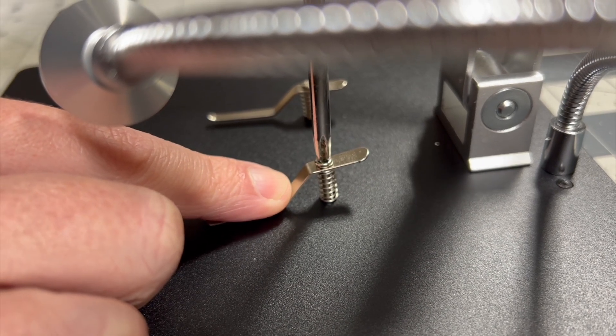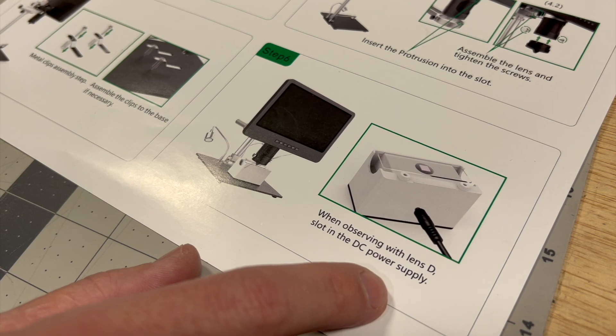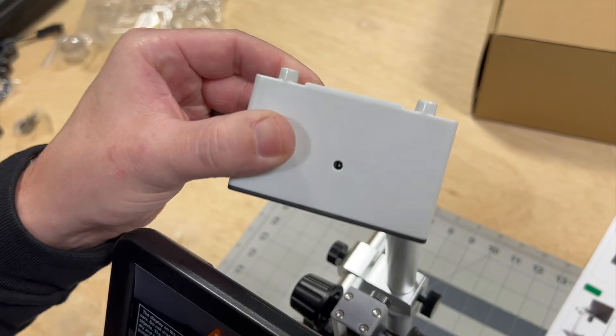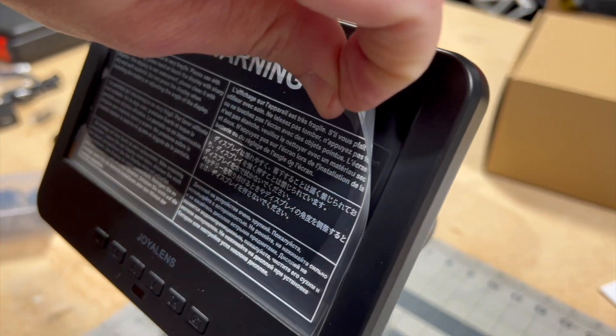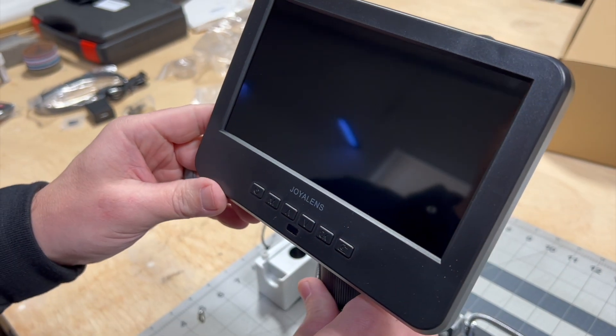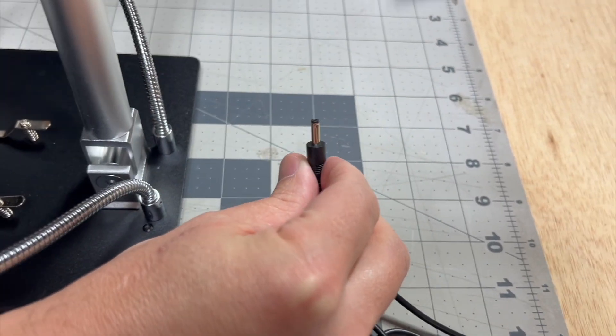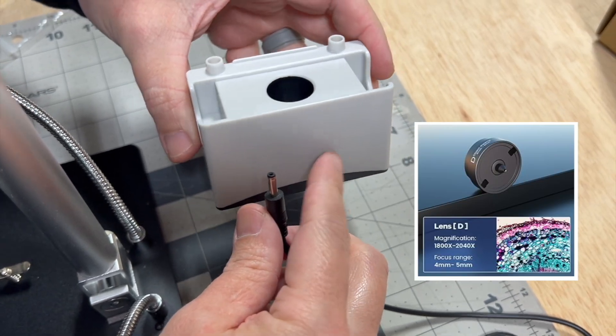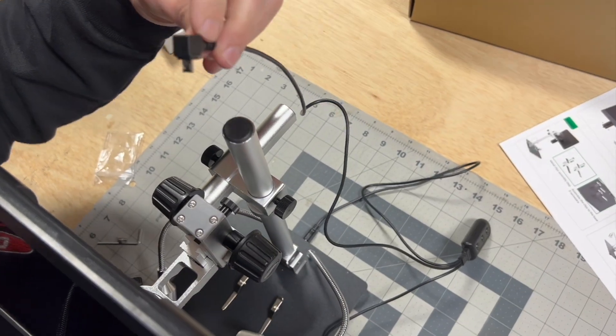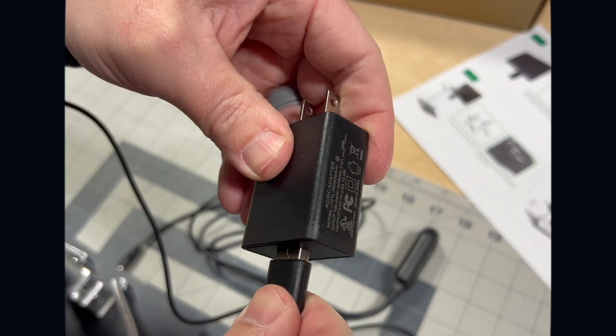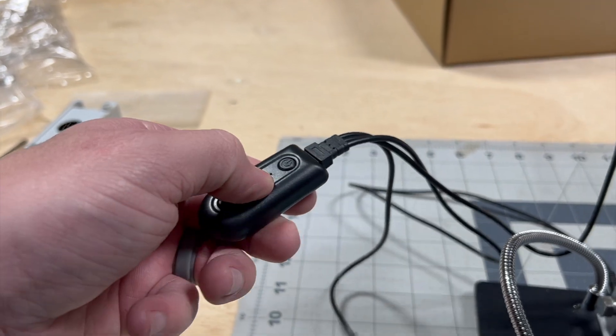These are just little hold downs for whatever you're working on. If it's a circuit board or something you can stick in there, you can obviously move them out of the way too. When we're using lens D, slot the DC power supply into the light box. So that's the white box and that's where we would put the DC. Now we have the physical assembly complete. Now we can go ahead and plug this thing in and see what it looks like.